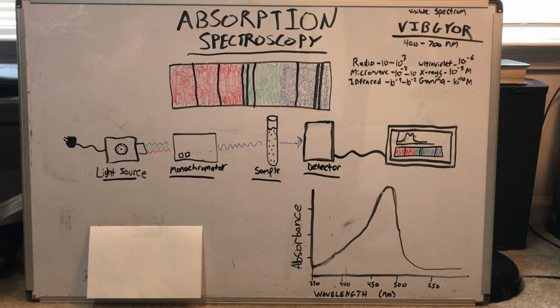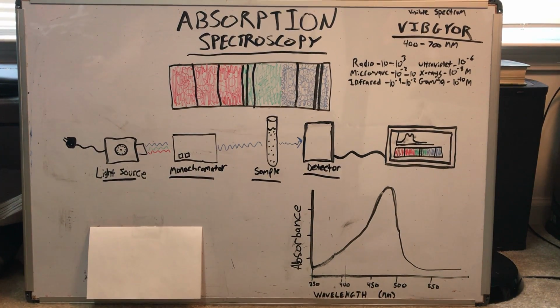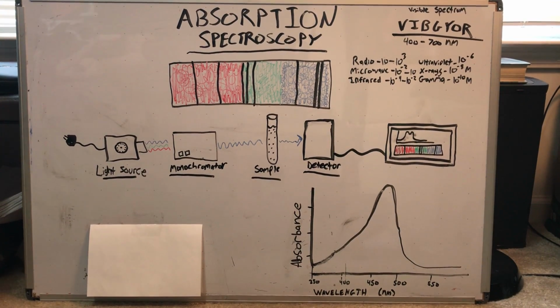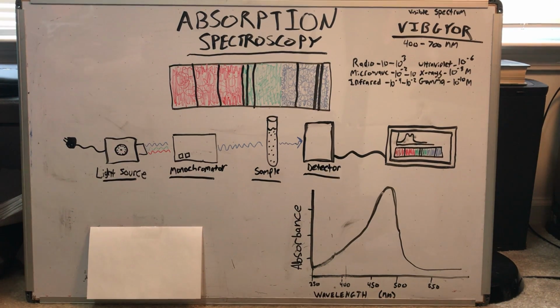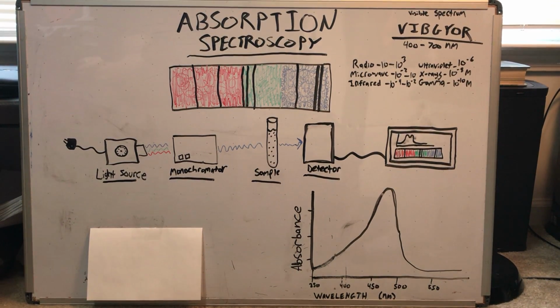When electromagnetic waves hit an object, some areas of the spectrum are absorbed while others will pass through. As a result, electromagnetic waves which can pass through are observed, and those that are absorbed by the object are left out of the observable data which is collected in an experiment.